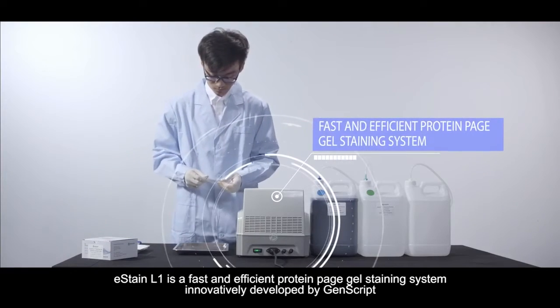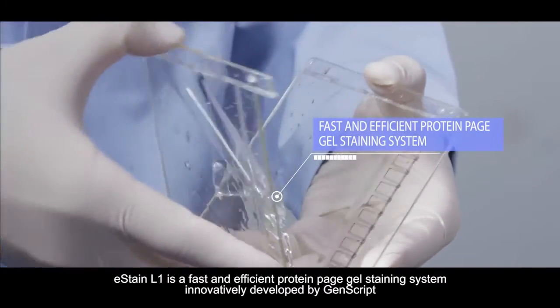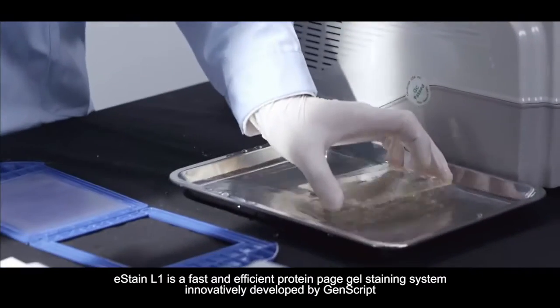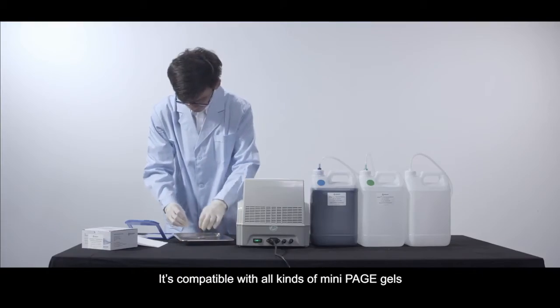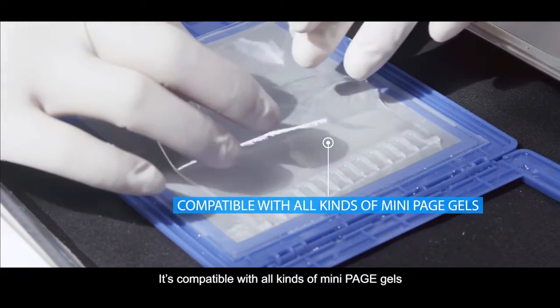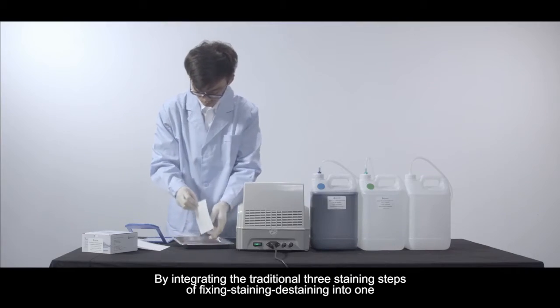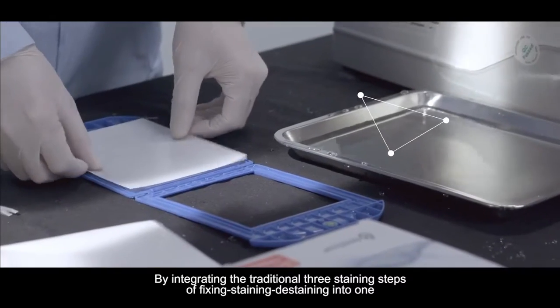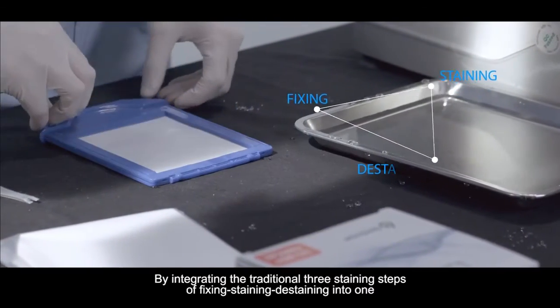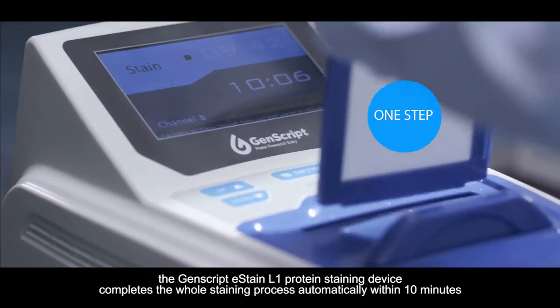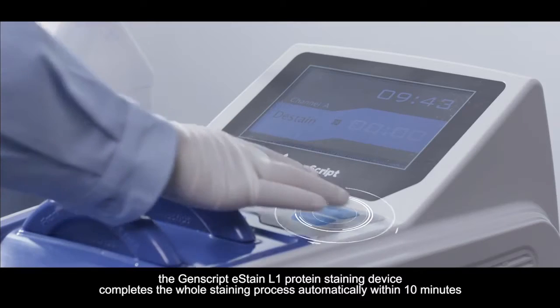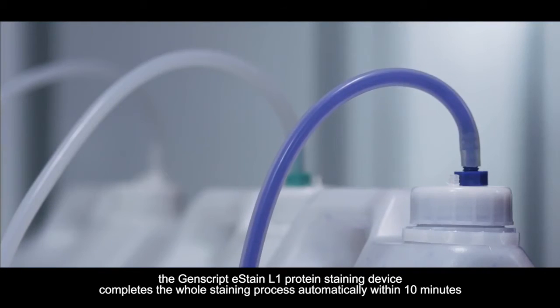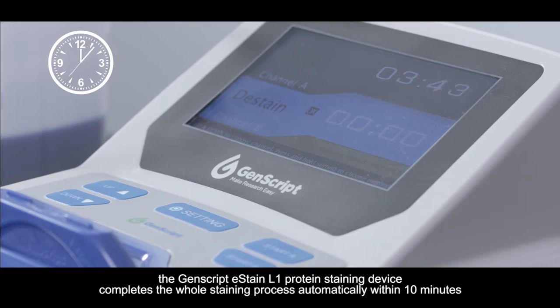eStain L1 is a fast and efficient protein page gel staining system, innovatively developed by Genscript. It's compatible with all kinds of mini page gels. By integrating the traditional three staining steps of fixing, staining, and de-staining into one, the Genscript eStain L1 protein staining device completes the whole staining process automatically within 10 minutes.